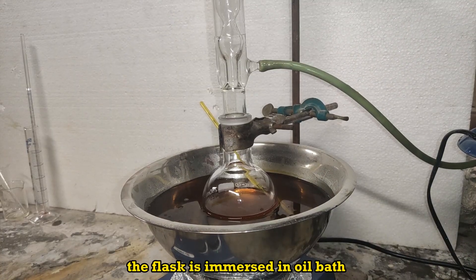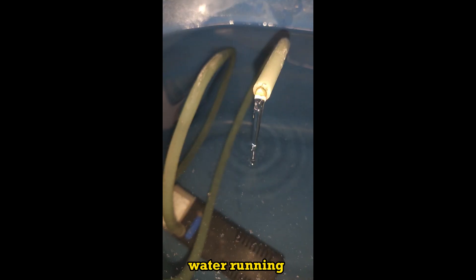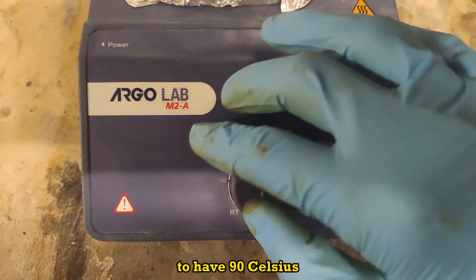The flask is immersed in an oil bath, a reflux condenser applied, water running. Temperature is regulated to 90 degrees Celsius.